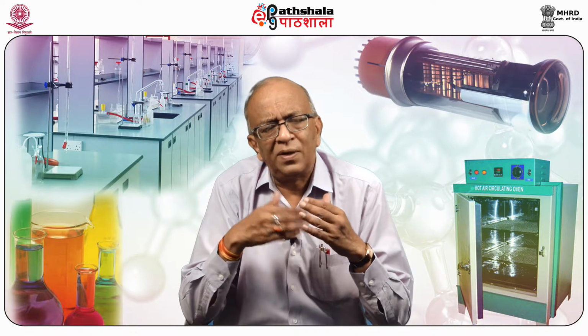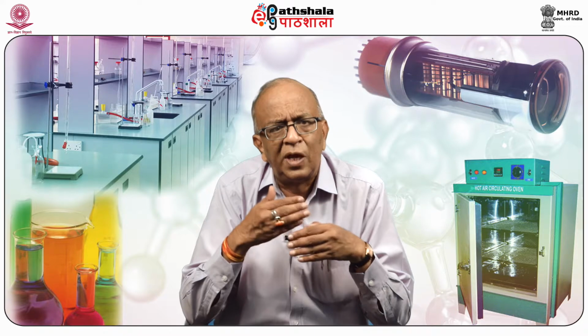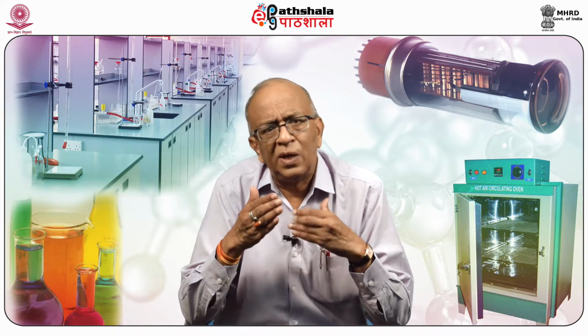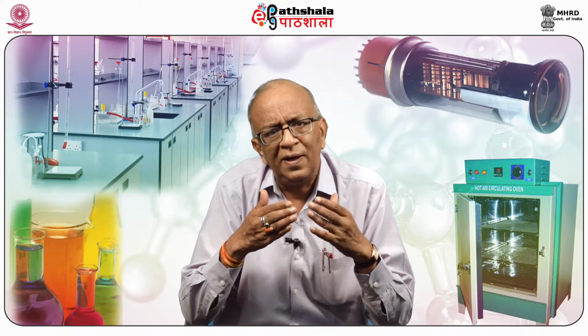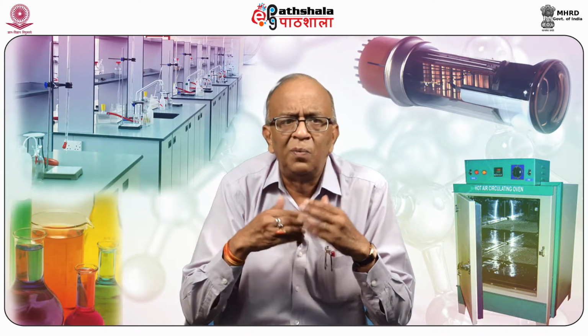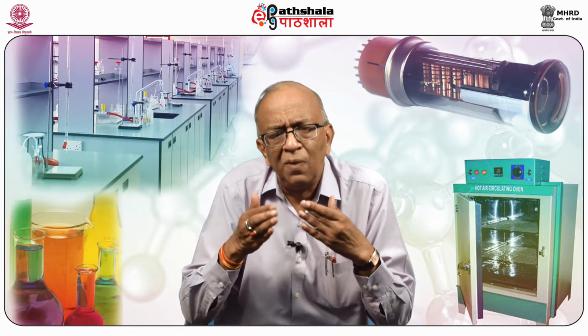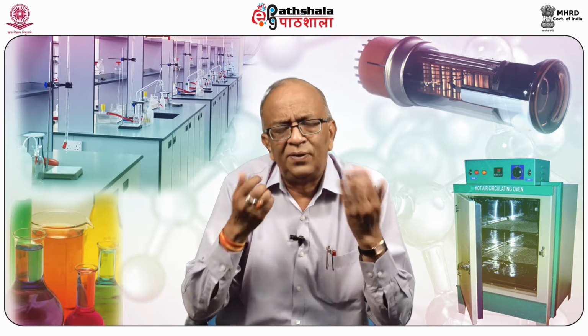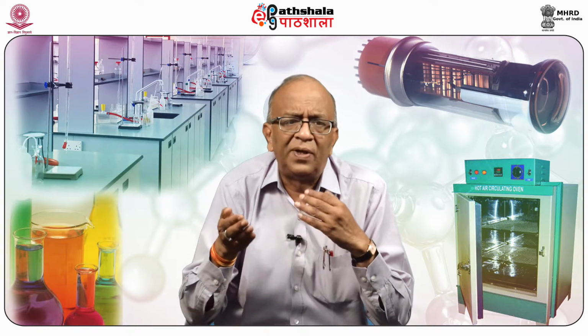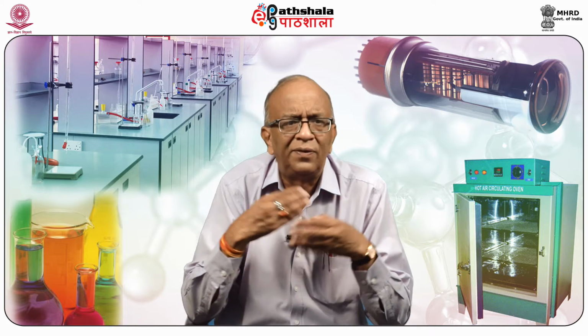Another type of thermal technique is thermomechanical analysis, and the instrument used here is a dilatometer. The parameter measured is volume or length, which is recorded versus temperature. So these are the different techniques. One by one modifications are coming.